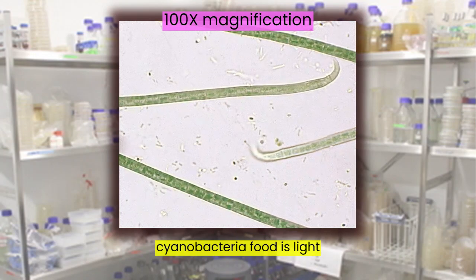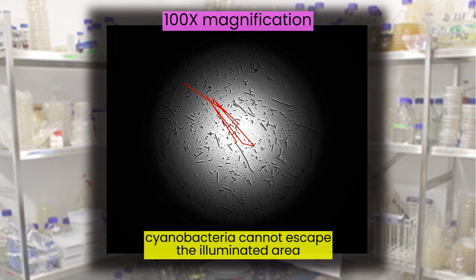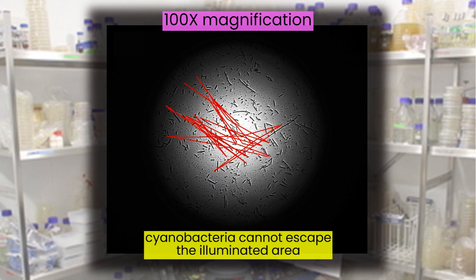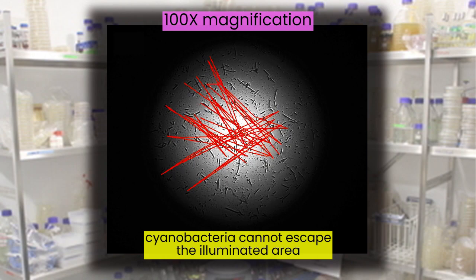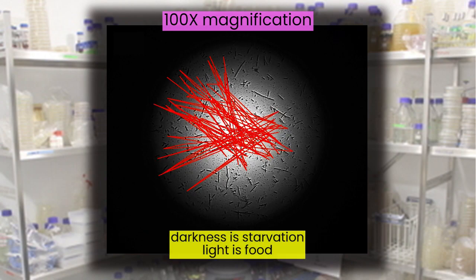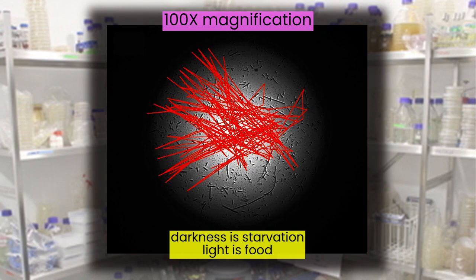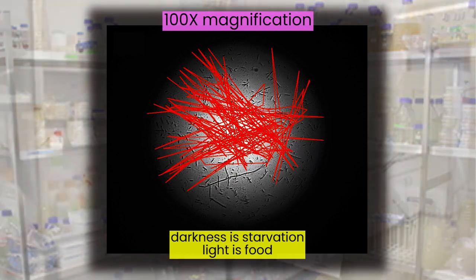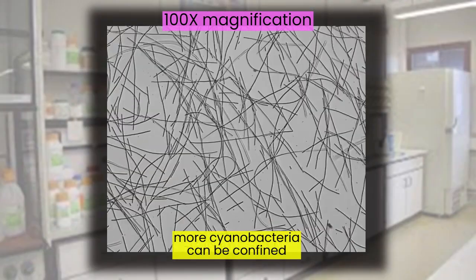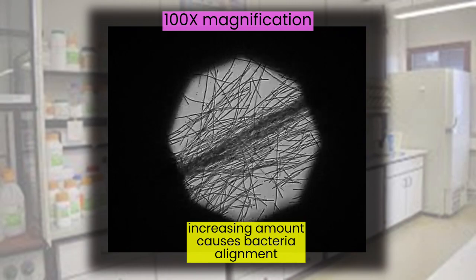Using optical microscopy, we can confine several cyanobacteria to a limited illuminated area. As we track the bacterial trajectory, we can see that it does not escape this illuminated area, because cyanobacteria will simply starve in the darkness, whereas light brings food and energy. More and more bacteria can be confined using light, and all cells will move towards the light source.